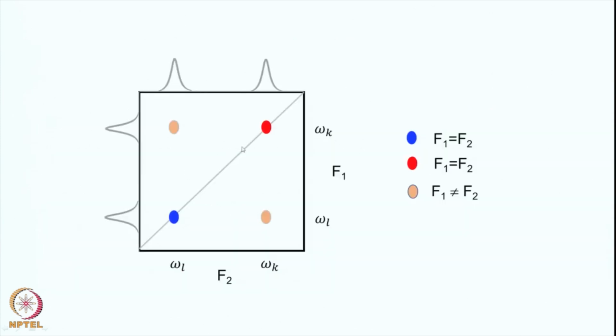Okay. Now schematically, if you wanted to represent it in a diagrammatic form, this is your 2-dimensional frequency domain spectrum and these are the two 1D signals here. So one frequency omega k, other frequency omega L. We started the calculation with the omega k frequency. We said that part of the omega k frequency remains at omega k and this produces the diagonal, and part of it is transferred to the spin L and this becomes your cross peak. So I generated from omega k this frequency and this frequency.